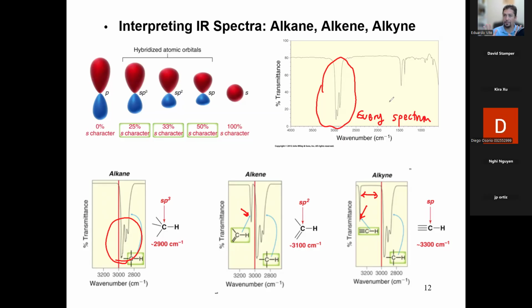So any questions about this? And also notice, some of you might be looking over here and thinking, well, what about this? We only pay attention to very specific regions. That could be another CH band. I don't know. I'm not looking at that. I'm only looking at the stalagmites and I'm looking to see if there's other peaks in between.